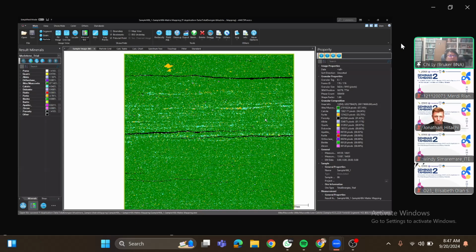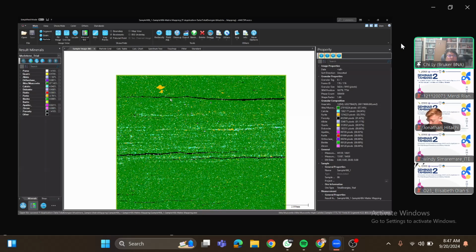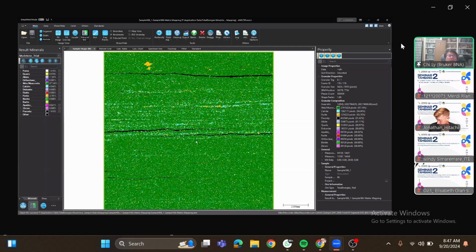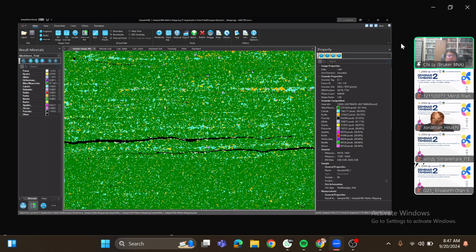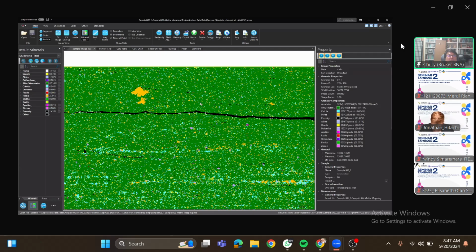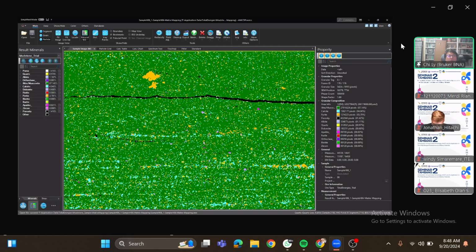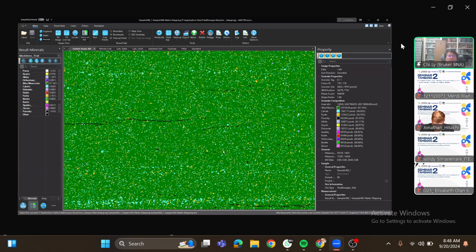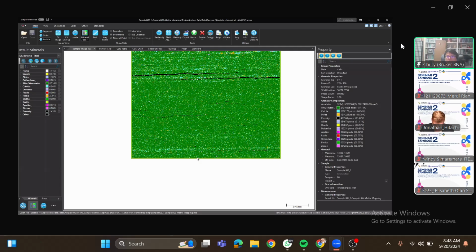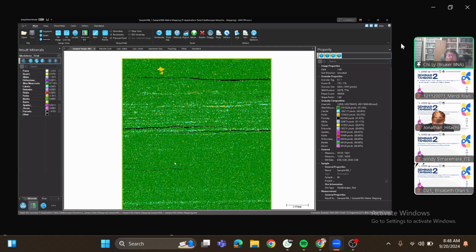In addition to a higher sand load at the top of this core compared to the bottom, because we're not just doing elemental composition, we can actually now look not just at the fact that there is sand at the top of the core, but we can actually look at the grain size, and visually you can see that there are coarser grains at the top compared to the much finer material at the base. And so you can start looking at the material not just in terms of composition, but you can also now look at it in terms of its morphology and understand exactly how this was deposited over time.